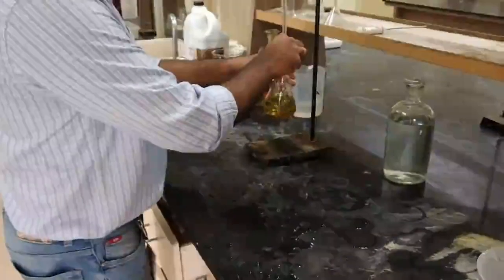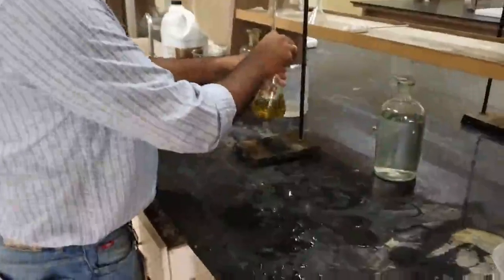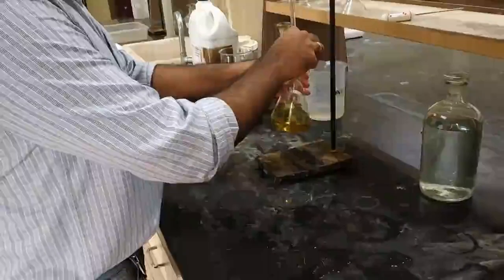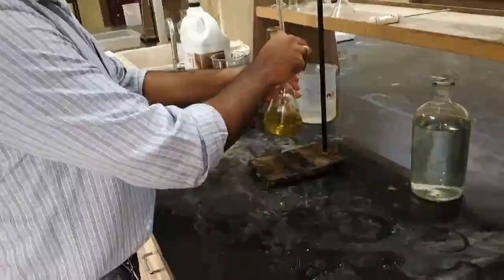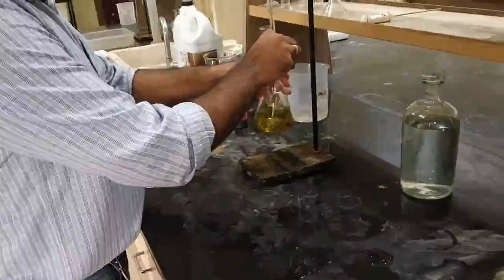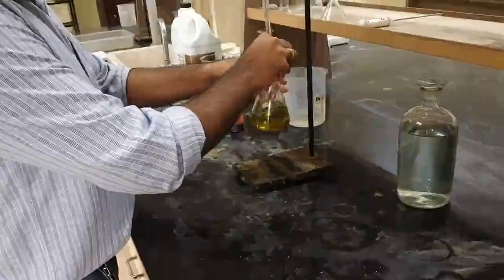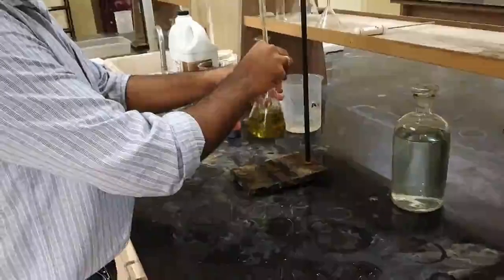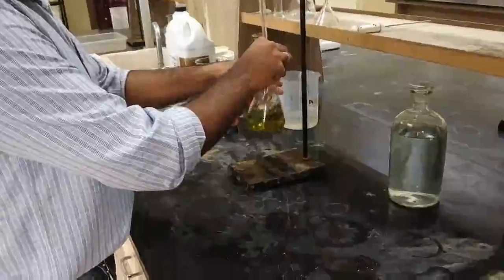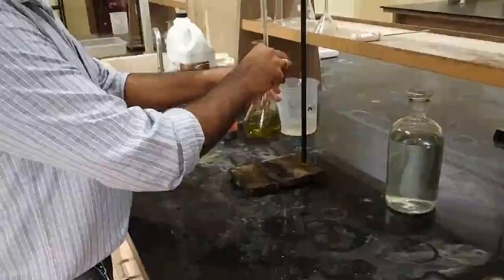So when we do titration, the color is going to change. Slightly different color than the previous color has now occurred.